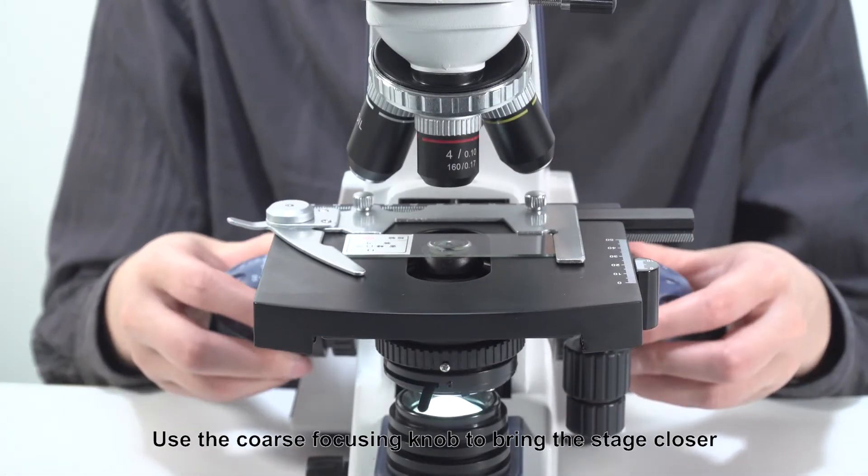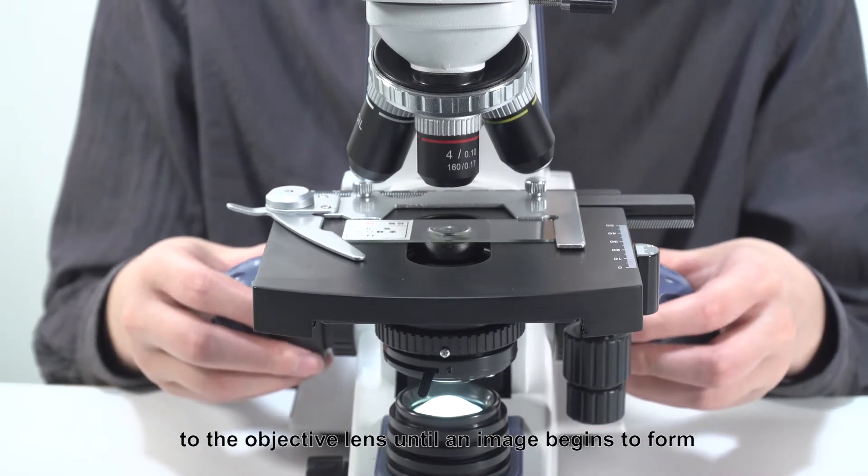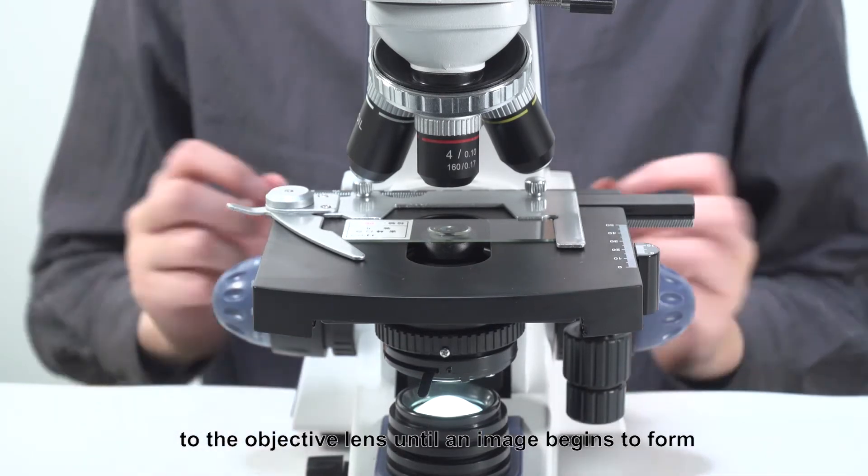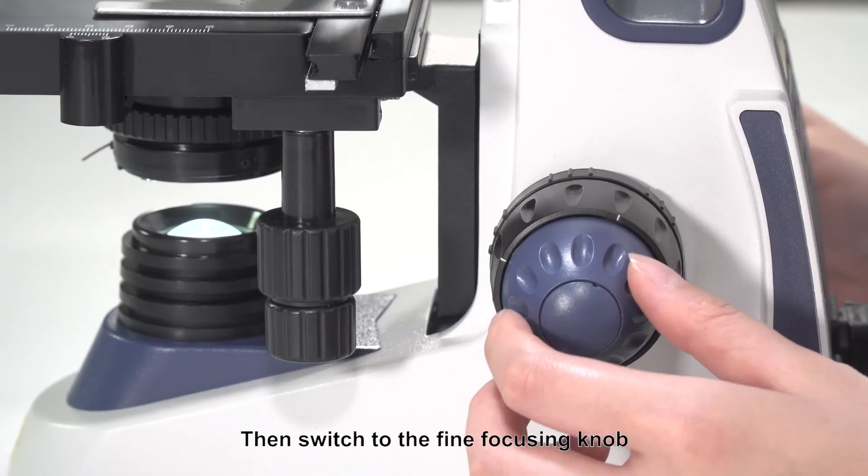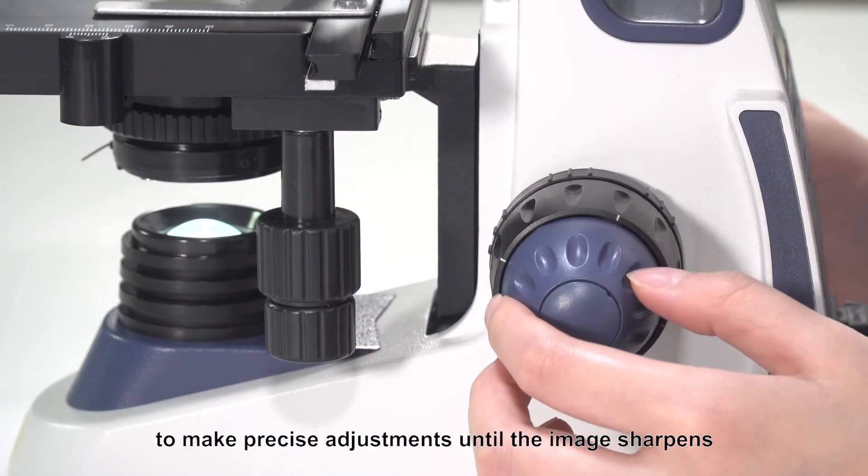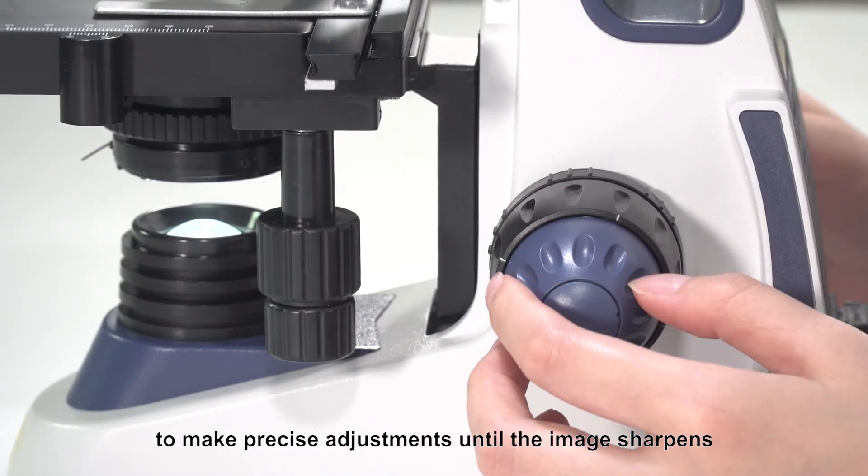Use the coarse focusing knob to bring the stage closer to the objective lens until an image begins to form. Then, switch to the fine focusing knob to make precise adjustments until the image sharpens.